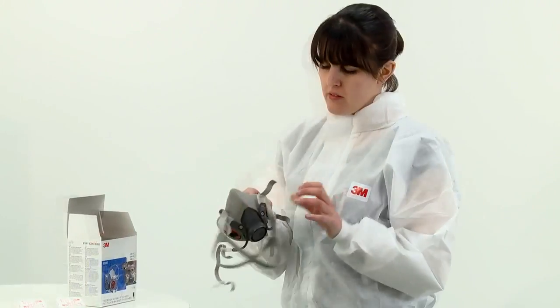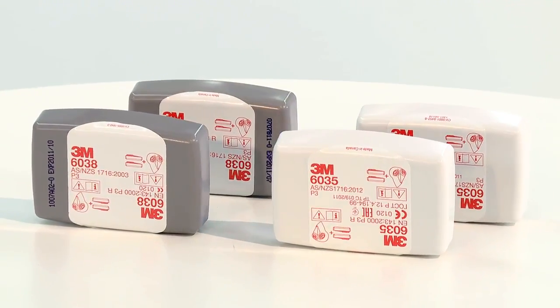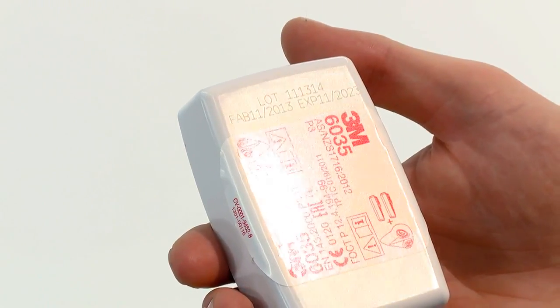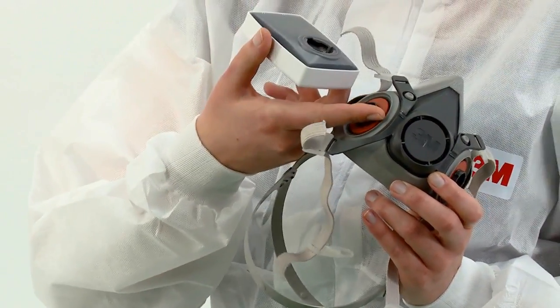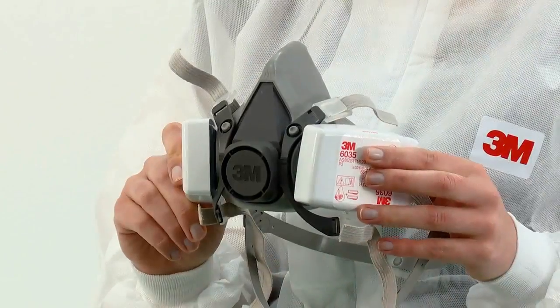Prior to fitting the respirator to your face, you should fit appropriate filters. First, we demonstrate the fitting of the 6035 and 6038 series particulate filters. Before fitting, check that the filters are within their use by date. Align the lines on the mask to the line on the inside of the filter and secure in place with a quarter turn clockwise. You should feel the filters lock into place.